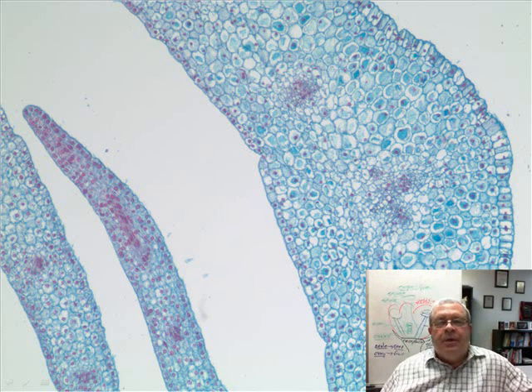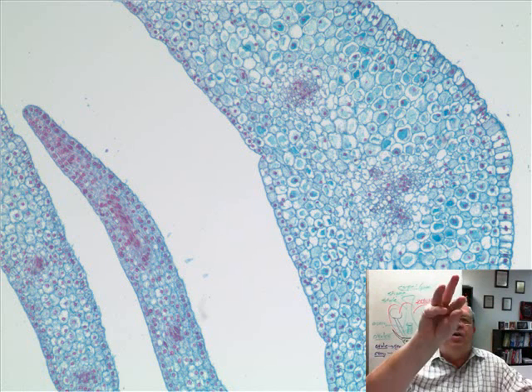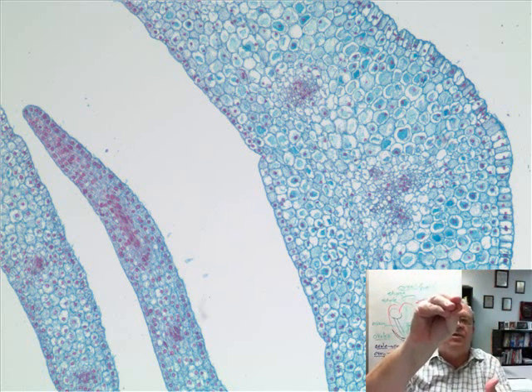All right, we've been looking at generic flowers, so to speak. Let's look at real flowers for just a couple minutes. What in the world do we have here? We have part of an unopened lily bud. It was cut straight across. An unopened lily bud cut straight across.